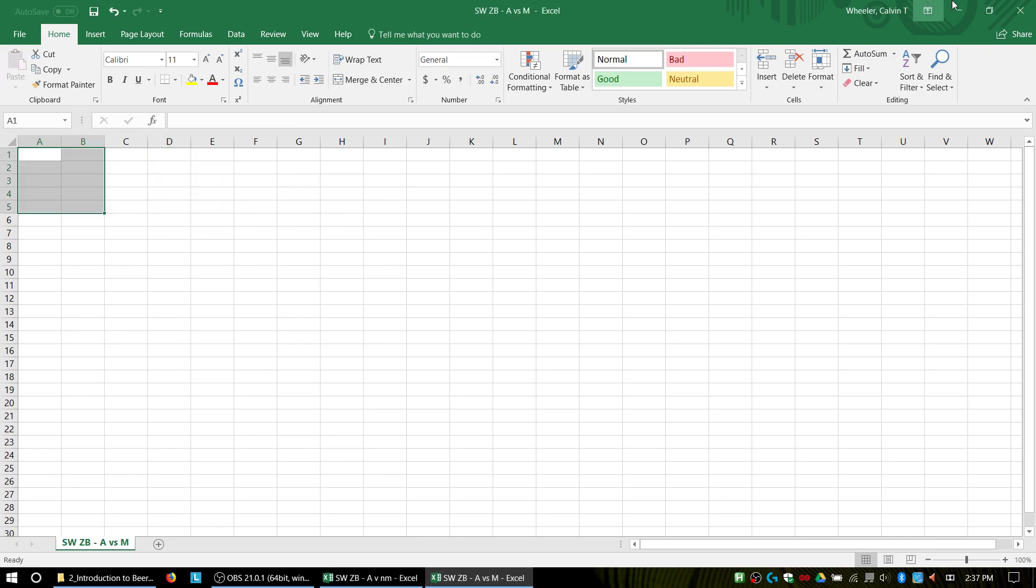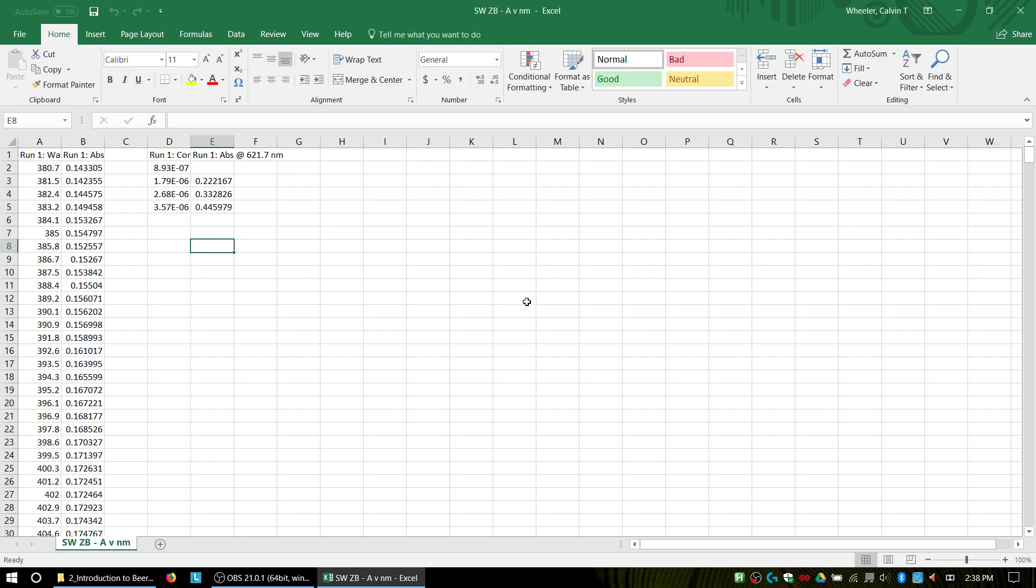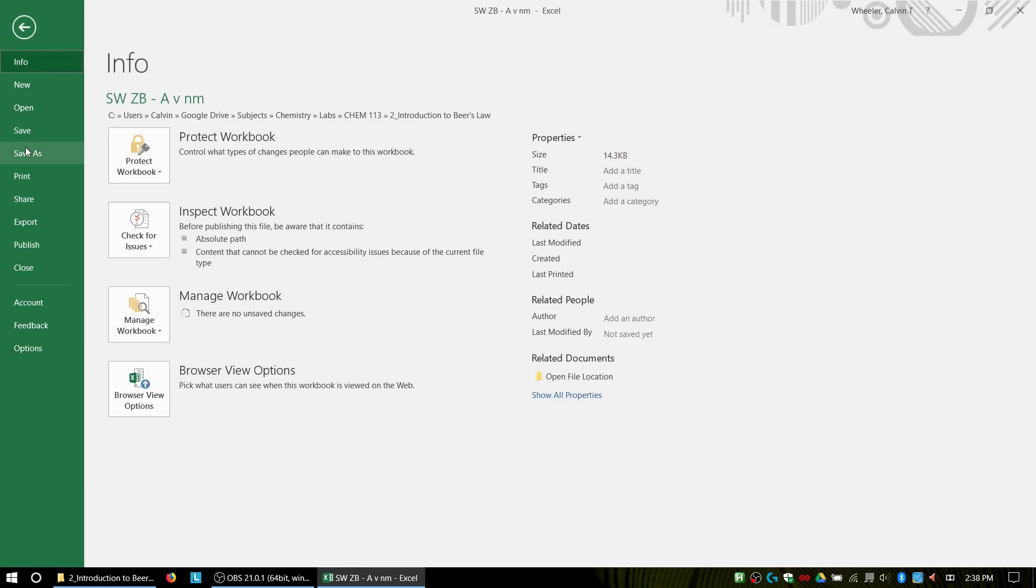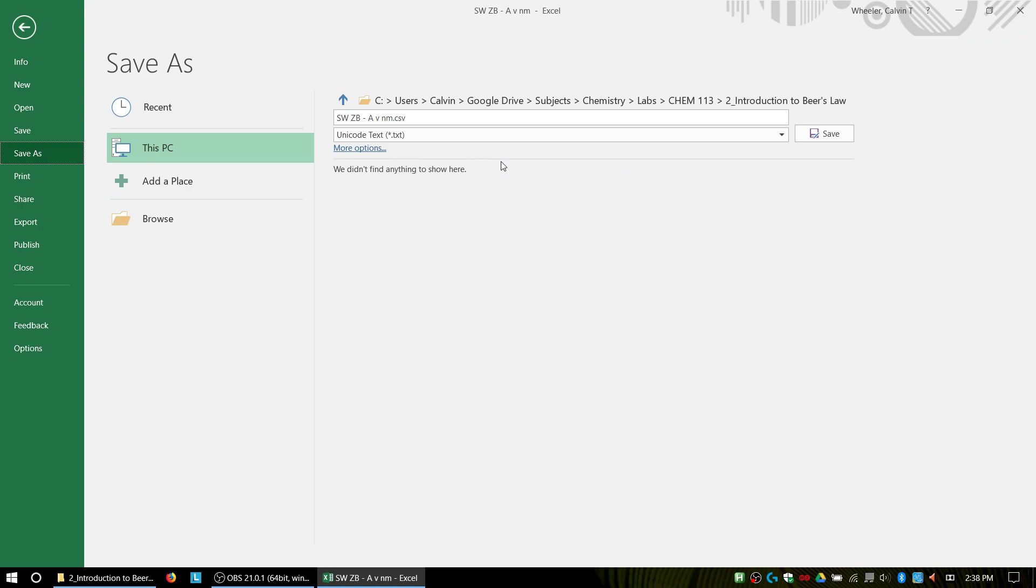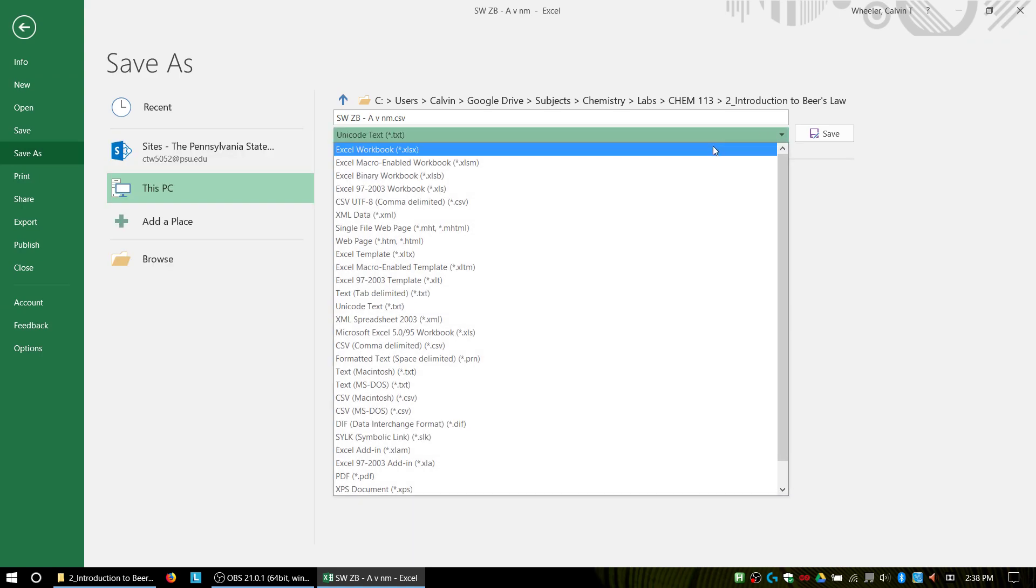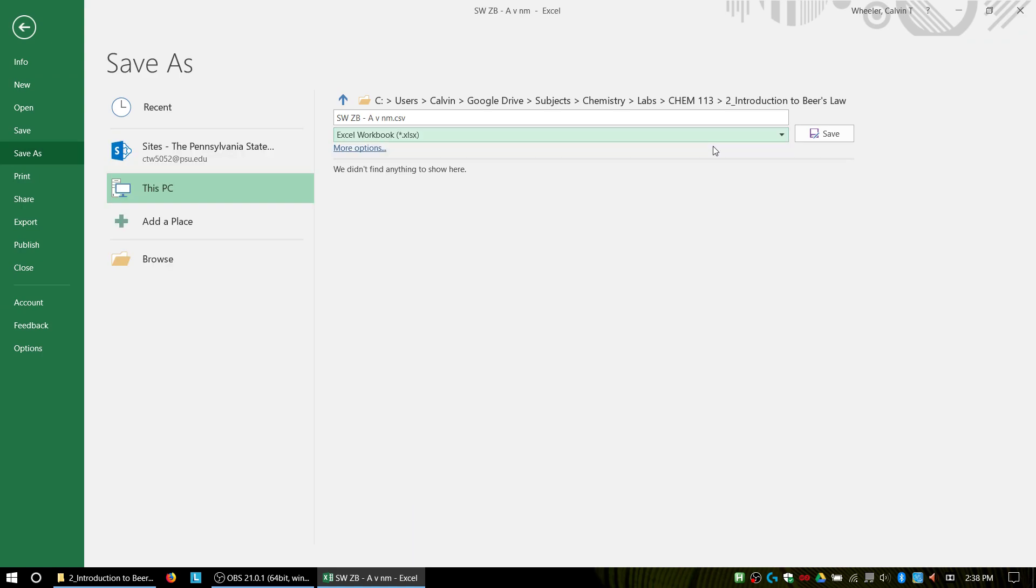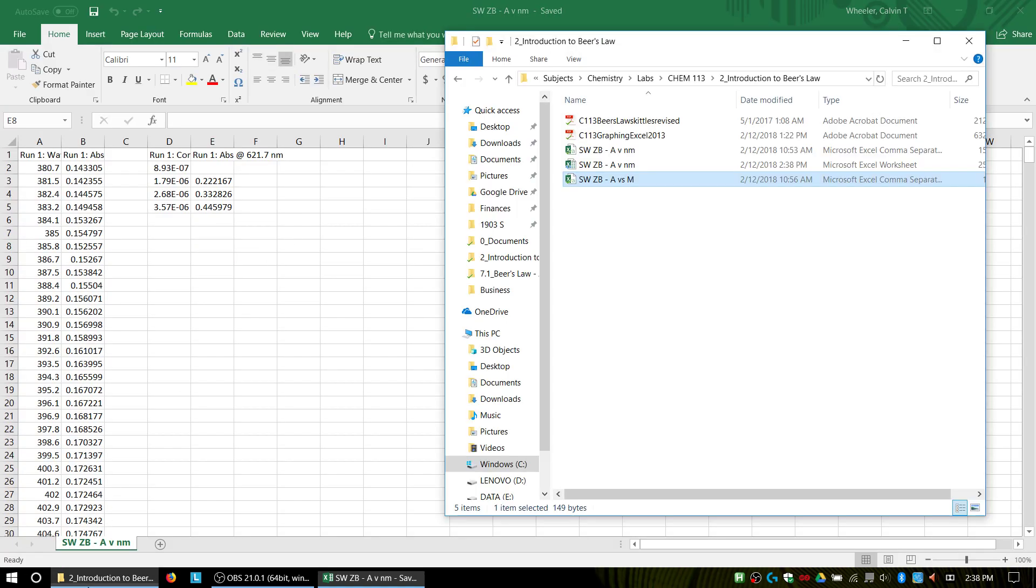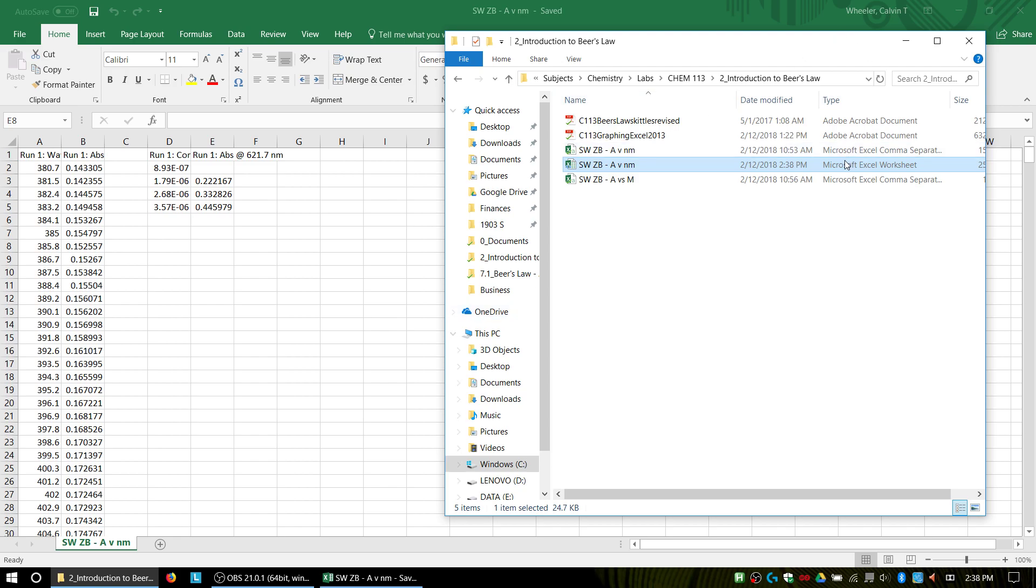I'm done with the other one, so close it. Don't save it, save it as a backup. Then I want to save this workbook, so File, Save As, an XLS file. Change the file type to XLSX, and I want to get rid of this .CSV extension. I'm going to hit Save, and it will make a new file right here that's a Microsoft Excel worksheet rather than a comma-separated file.